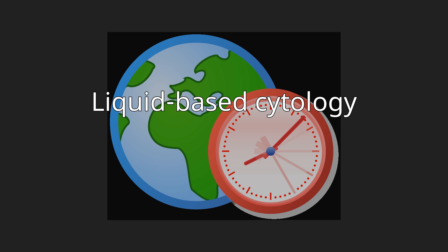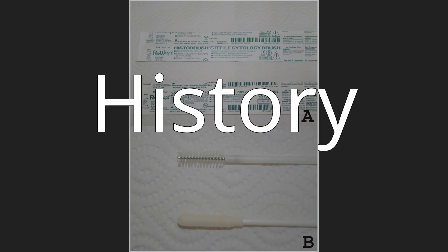For many years, efforts have been made to develop methods that would enhance the sensitivity and specificity of the Papanicolaou smear, also called Pap smear. Emphasis has been placed on creating automated screening machines whose success depends on a representative sampling of cells on standardized slides containing a monolayer of well-stained, well-preserved cells.